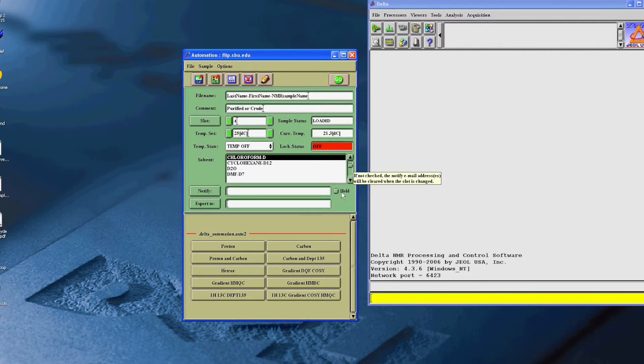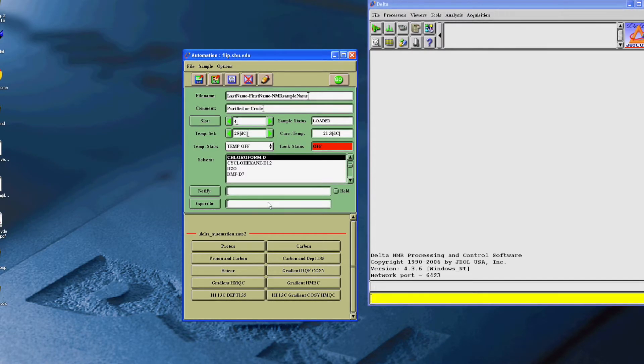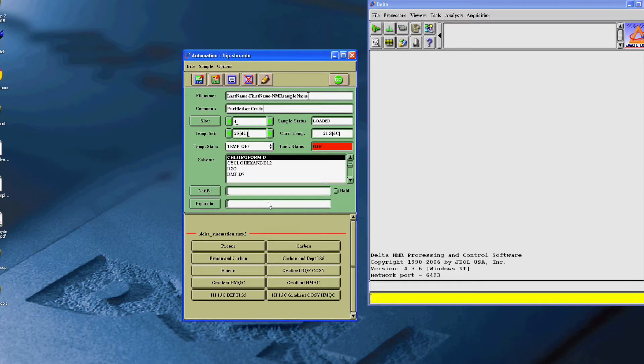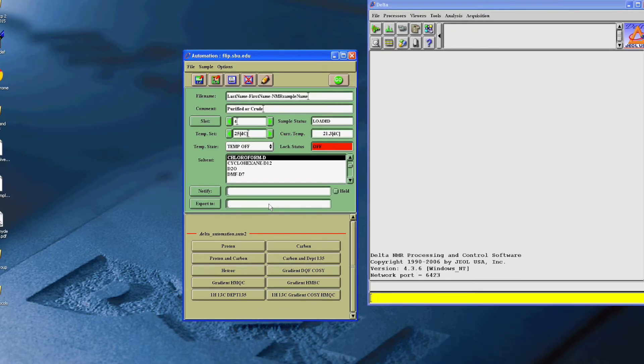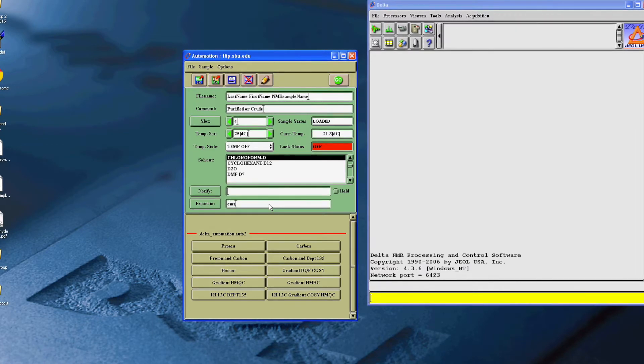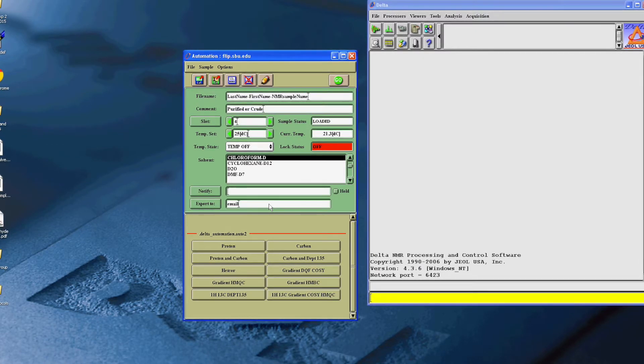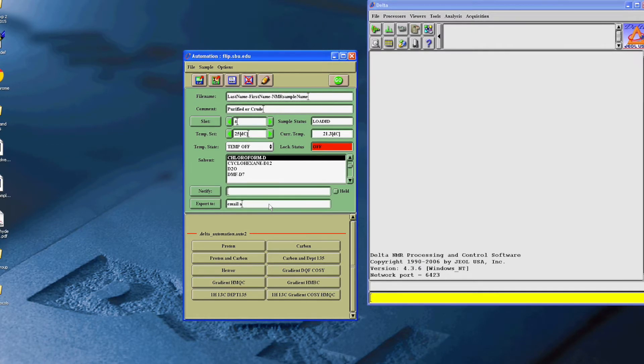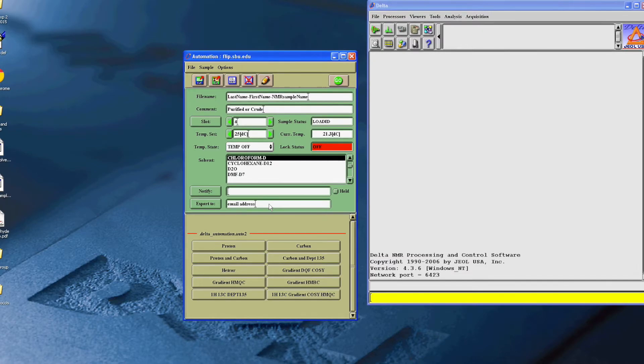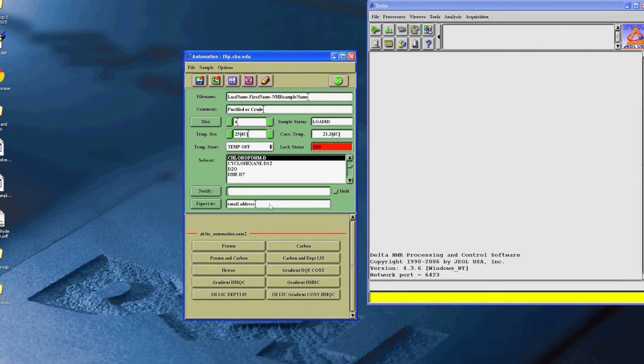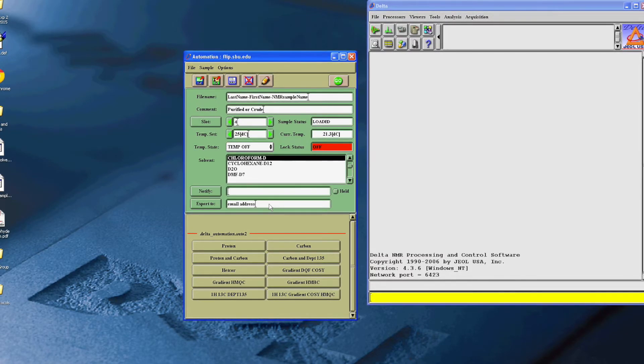And then, make sure in the Export To line, you type in your email address. If you don't type it in this line, you won't get your results after the NMR is completed. Again, make sure it's in the Export To line and type in your email address.